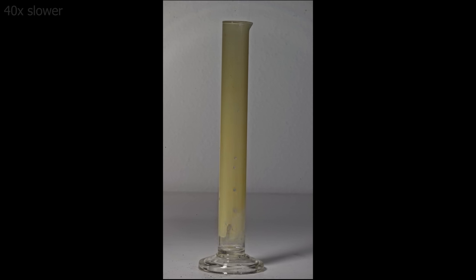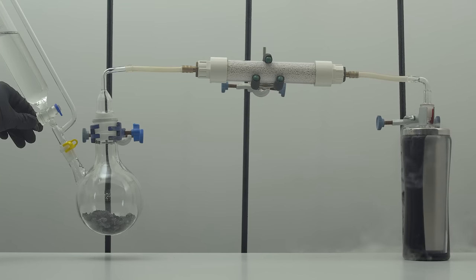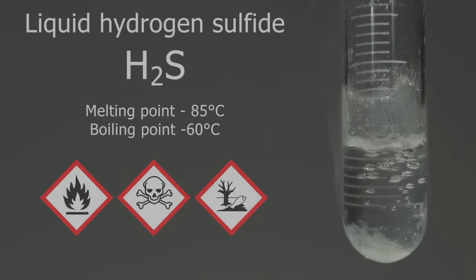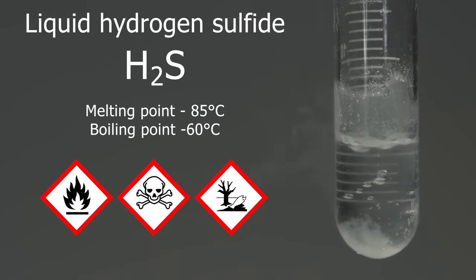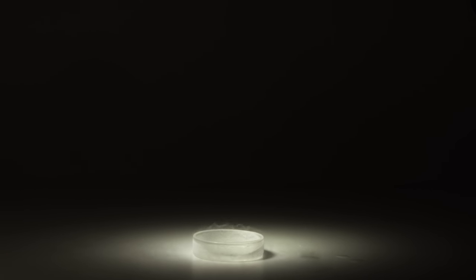Now let's move on to the explosive barking dog reaction. For this one, we'll take liquid nitrous oxide and liquid hydrogen sulfide produced in my previous video. You should definitely see it, as it has lots of unique reactions of hydrogen sulfide, as well as a low viewer count. Mixing these two liquefied gases will get us a quite reactive mixture. Take a look at how it behaves when ignited.